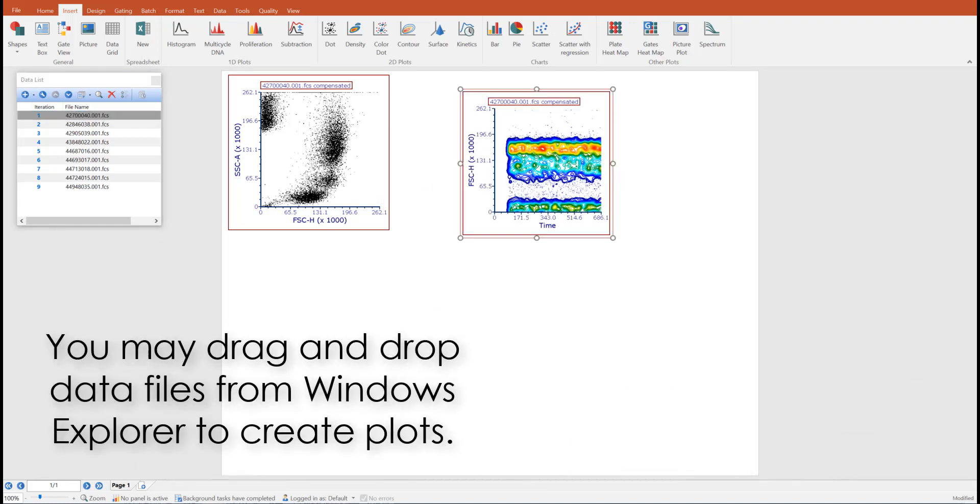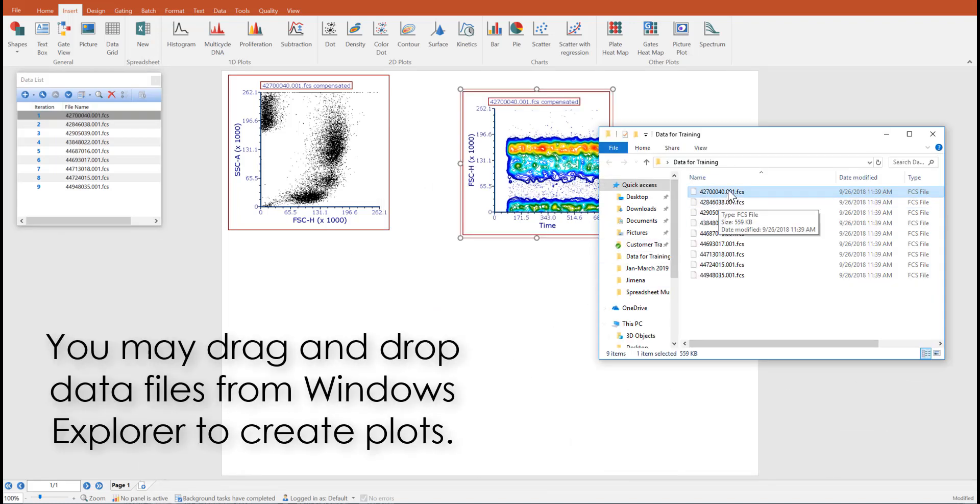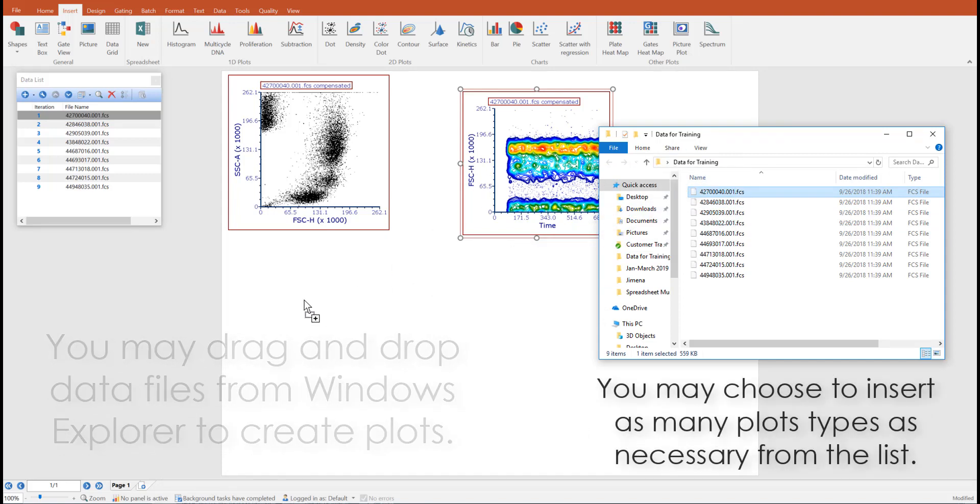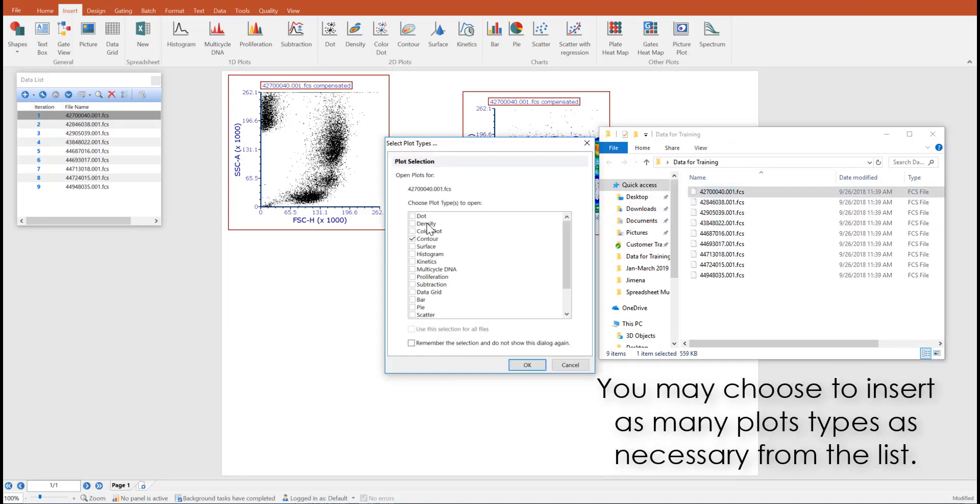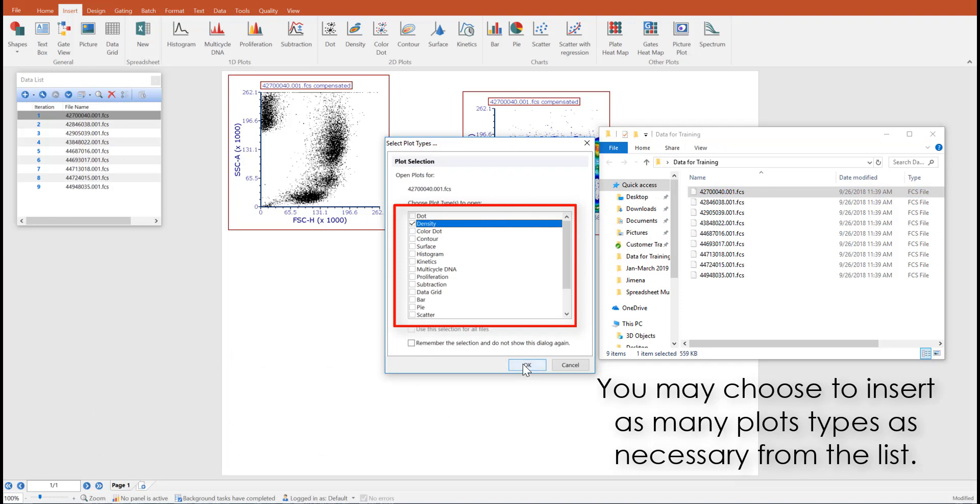Additionally, you can drag and drop data files from your data explorer into your FCS Express layout and choose which plot type you would like to insert into the layout.